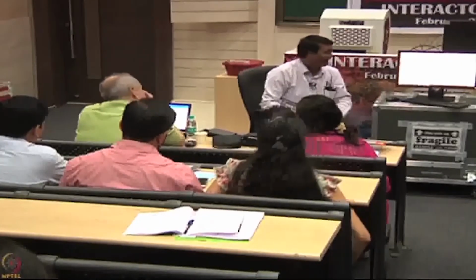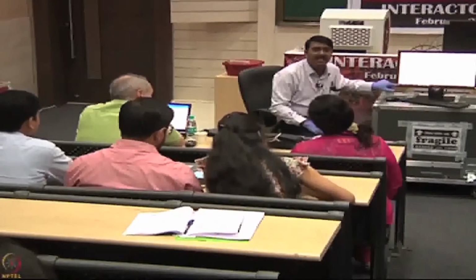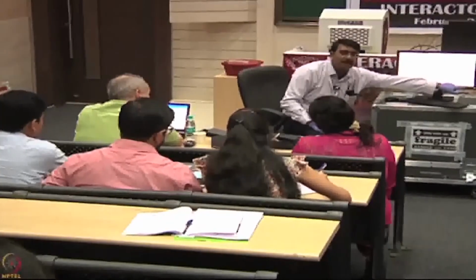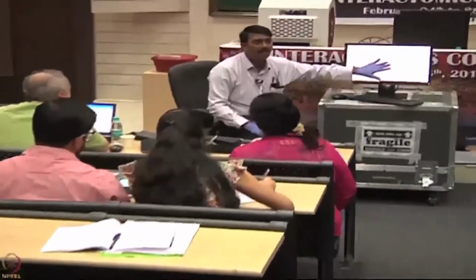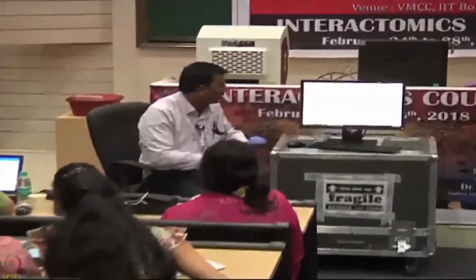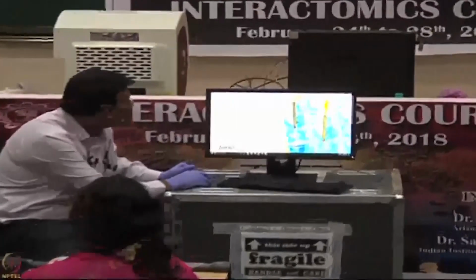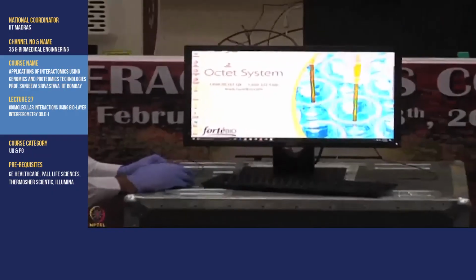Now the status says the instrument is ready and the experiment is finished, and here it also says the experiment is complete. So we got the data. Now we have to go for the data analysis. I will minimize this, then go for the data analysis. I will double click on the data analysis.